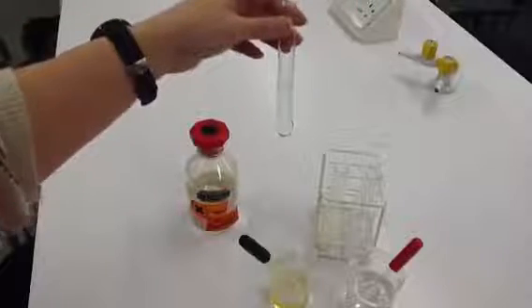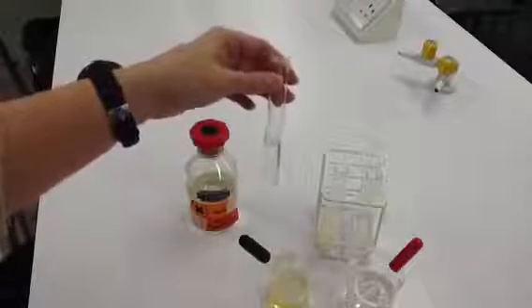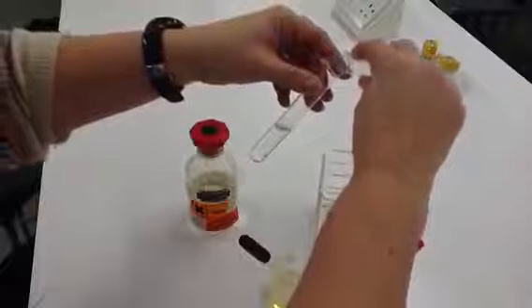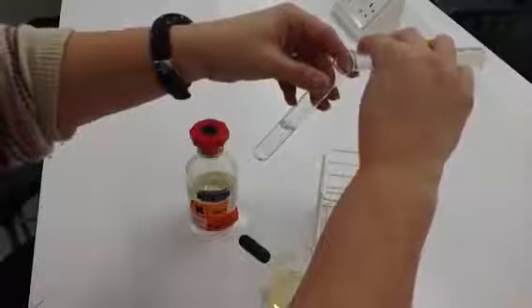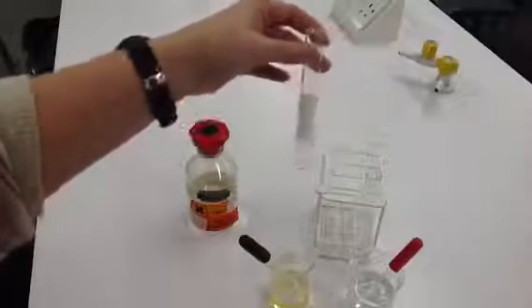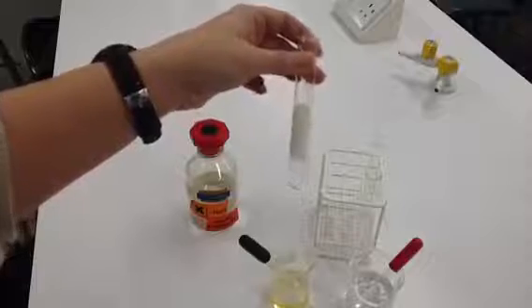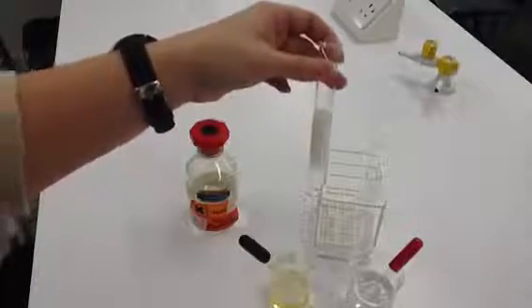And then we take a second test tube, which has just some distilled water in, and we take our tube that has our sample in, and we what we call decant. So we pour our sample into the tube with water, and as you can see here, the solution has turned a milky, what we call a milky emulsion. It looks like white emulsion paint.